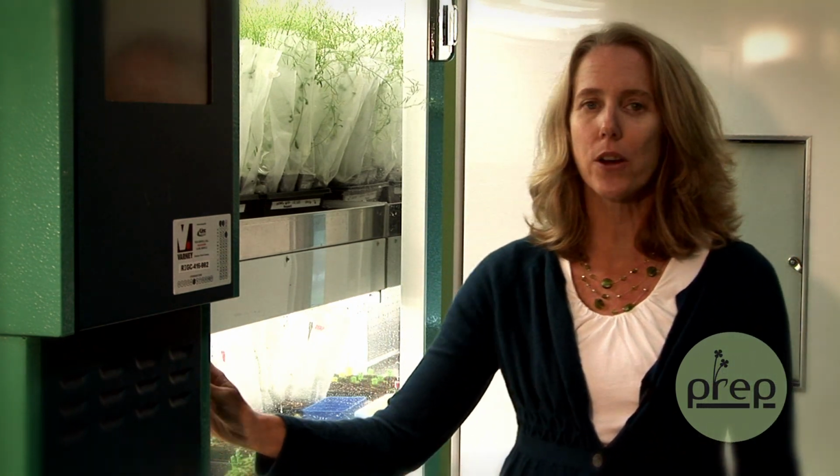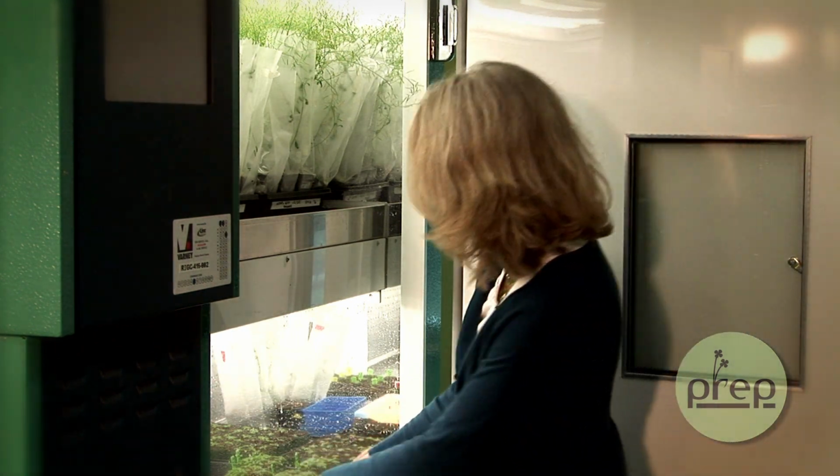So we're now in a growth room, and what you see are a series of growth chambers. They're light and humidity and temperature controlled. They're called reach-in chambers because you can just reach in and get your plants. And so what I'm holding is the P80 mutant, and then a plant that I'm going to compare it to called a wild-type plant. This plant has a normal P80 gene functioning in it.